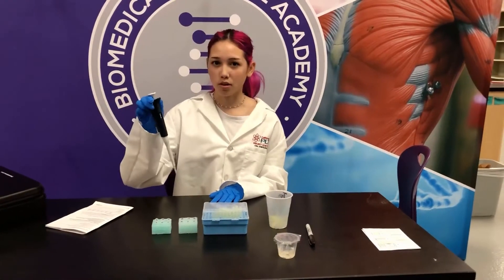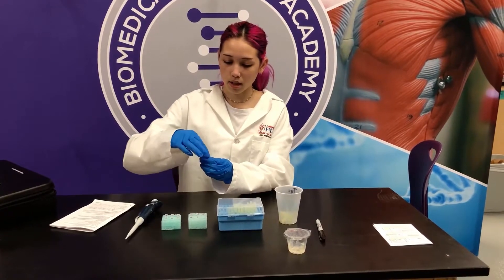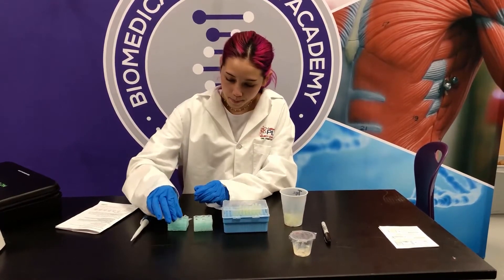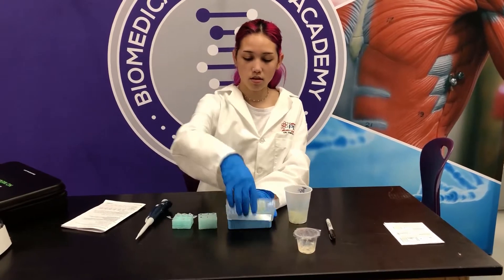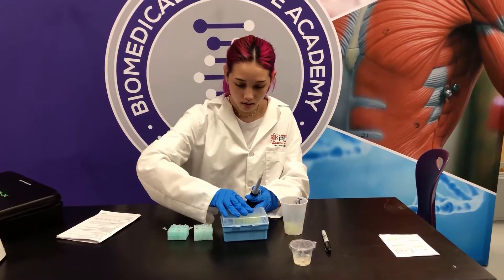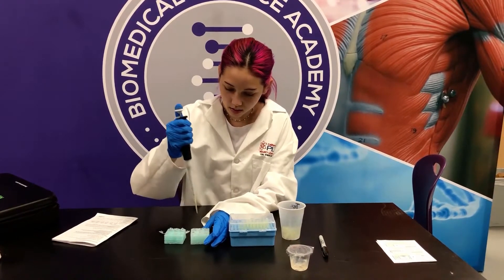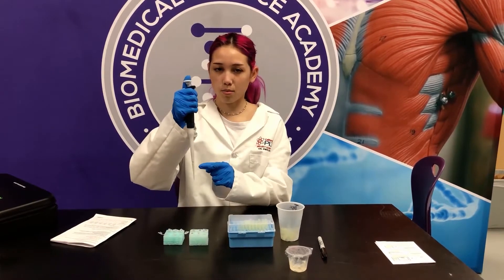I've already set my micropipette to 10 microliters and now I'm going to open up missing person number one DNA, set it back down, and then I'm going to open up the three other empty tubes and put them back down. Now I'm going to take my micropipette, put on a new tip, and take some of the DNA from missing person number one and put it into the first empty tube. I'm going to use the same tip because it's the same DNA.